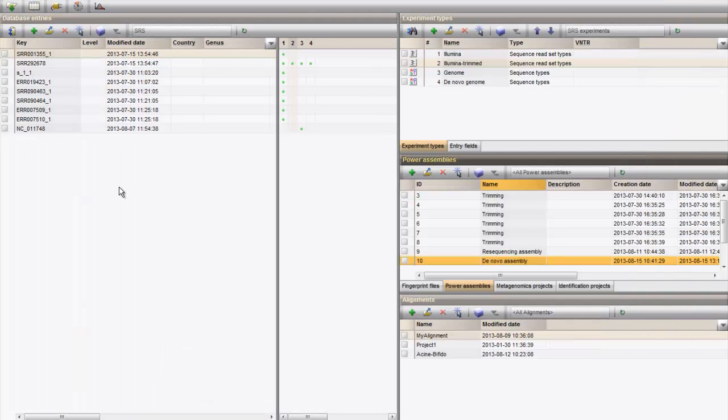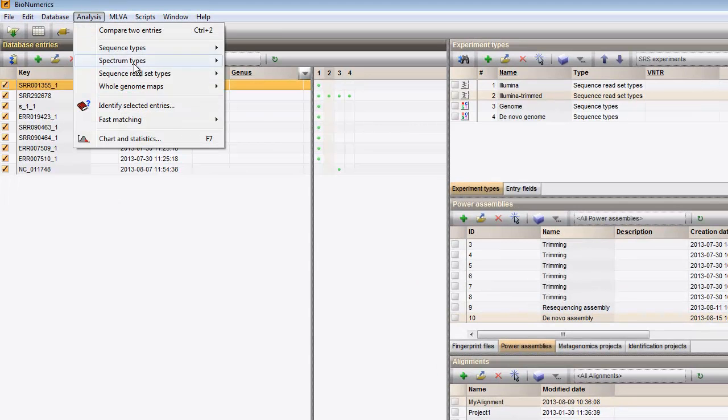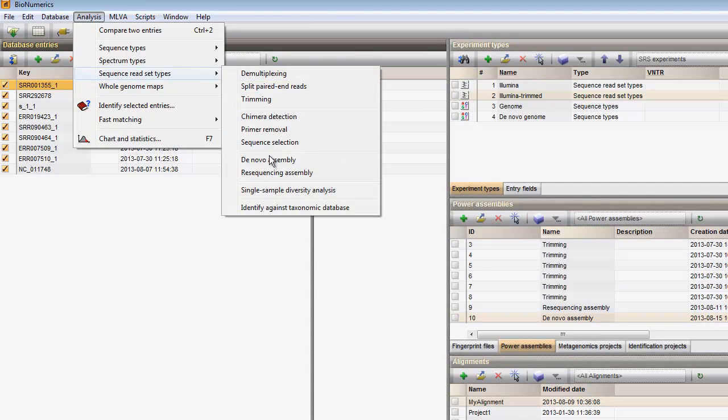If you want to run multiple samples in parallel using the same assembly pipeline, you can do this by selecting all the entries in the database and by starting the assembly simultaneously on the database selection. This will automatically generate an assembly project for each sample and will execute them in batch.